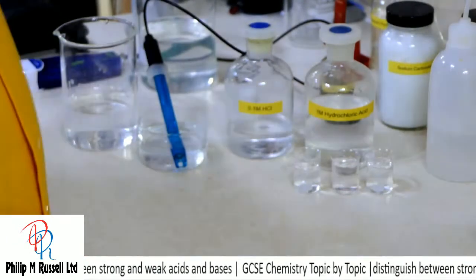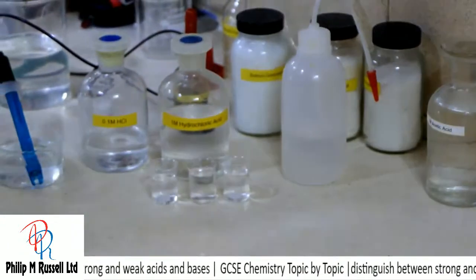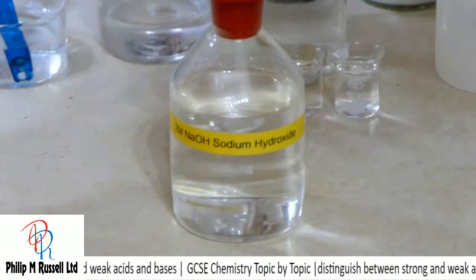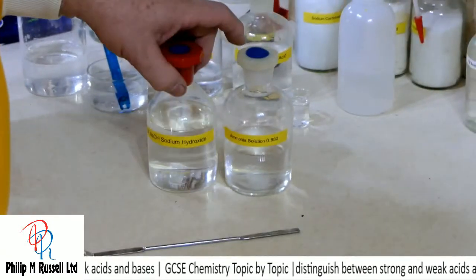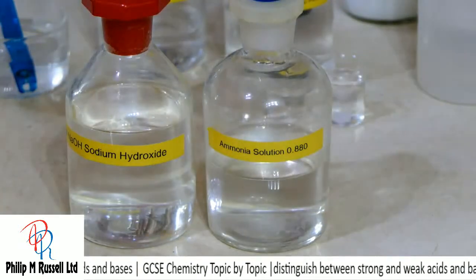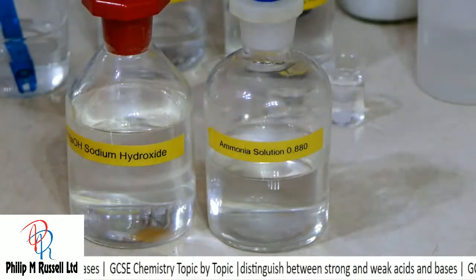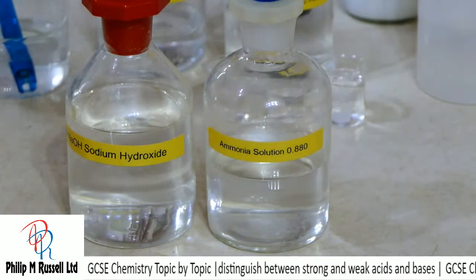How about strong alkali? Well, let's compare that with a strong alkali, and I've got here some 2 molar sodium hydroxide. That's pretty strong. We've got also what's called 880 ammonia, which is very strong ammonia, and then I've also got, he says, quickly cheating and grabbing hold of something, I've got my sodium hydroxide, its friend.